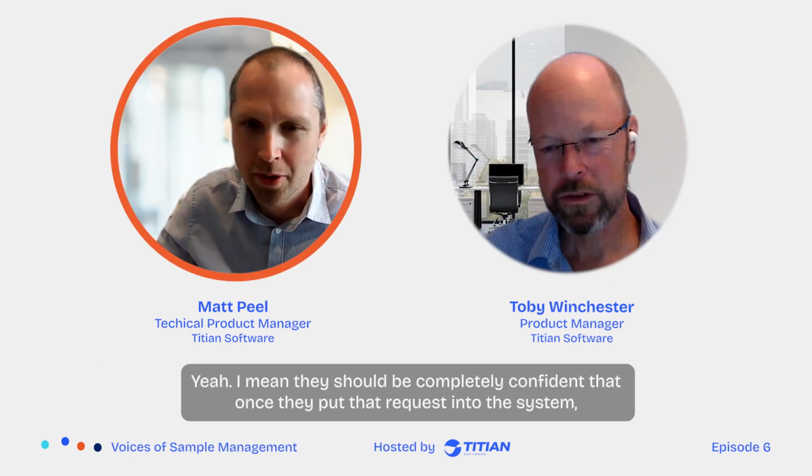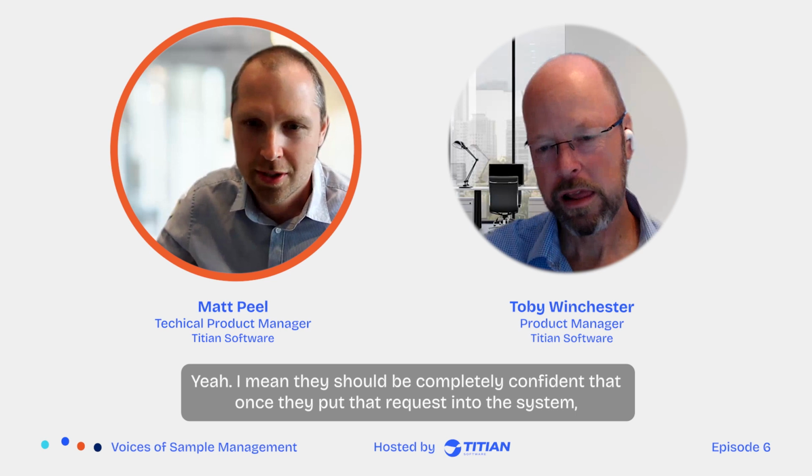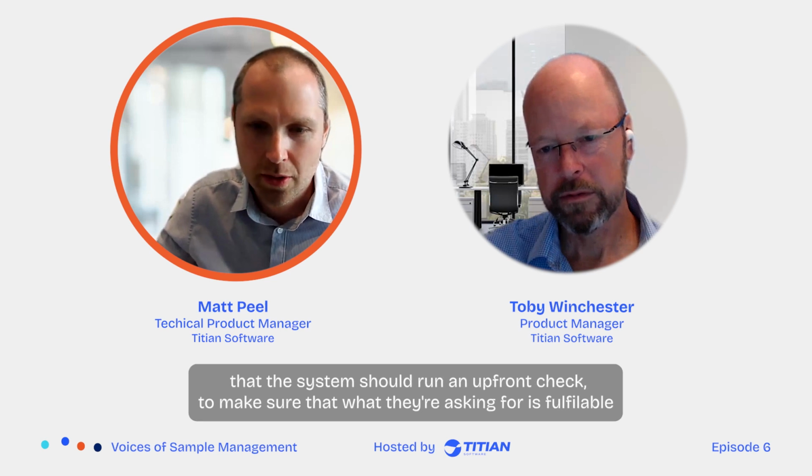Okay, cool. And then I suppose, how confident should the requester be that they're going to get their items, their dose response, their mixtures plated? Yeah, they should be completely confident that once they've put that request into the system, the system should run an upfront check to make sure that what they're asking for is fulfillable.